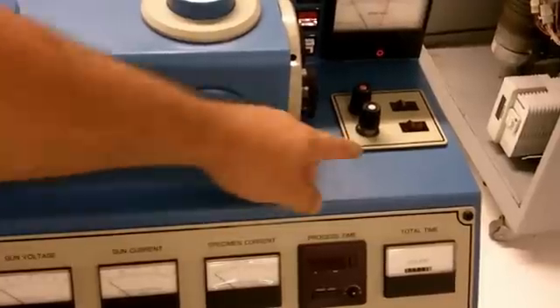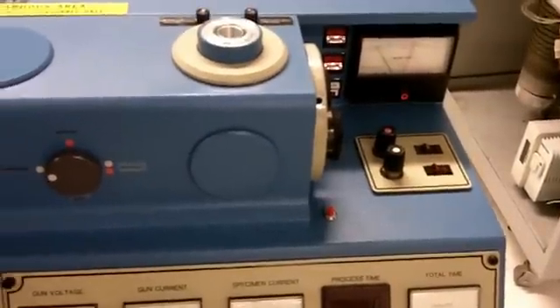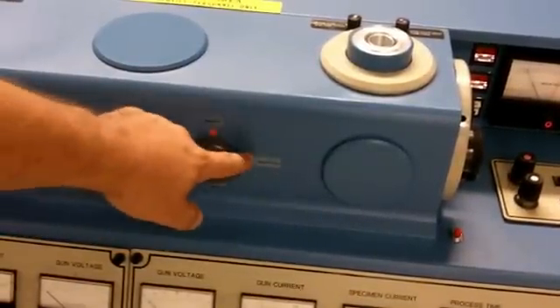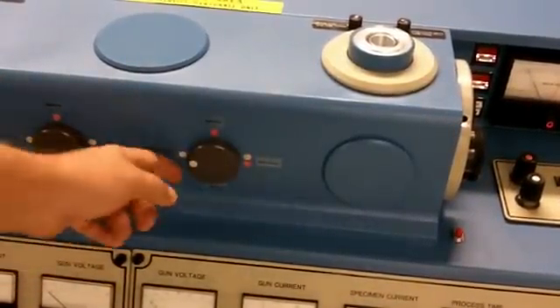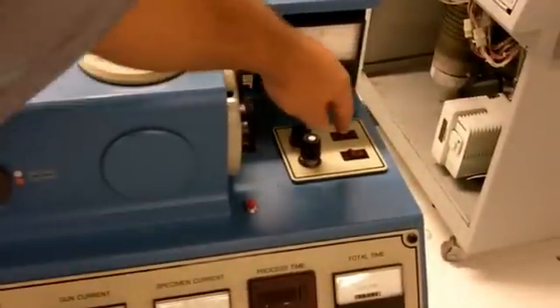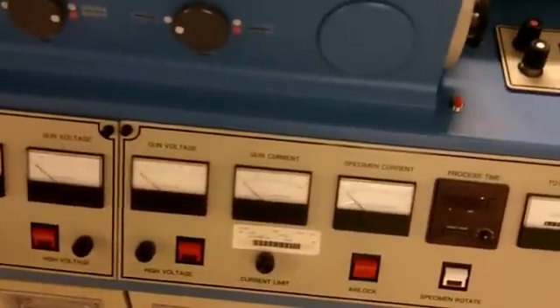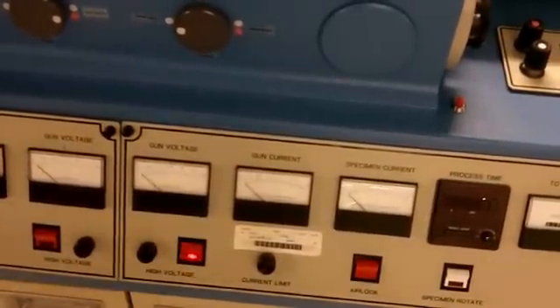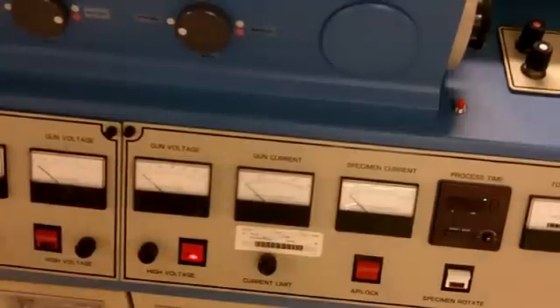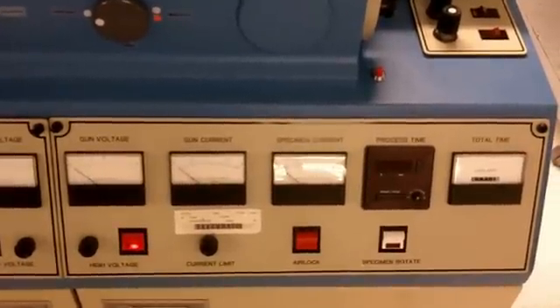Up on the right, you will see we have the selector switches — one red and one white. Over here we have our gun selector: white, red, or both. Right now I have it set on white, so I am going to turn on the gas for the white gun. I am going to turn on the high-voltage button. Please note: keep your high-voltage or current knobs down so that there is no spike in the current in the system.